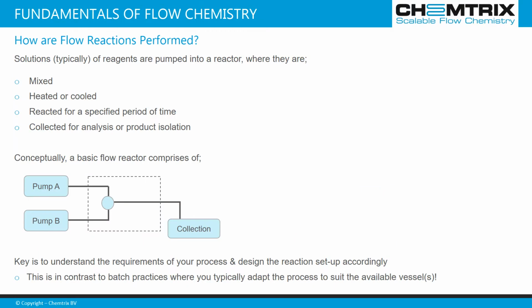For those of you that are new to continuous flow reactors, I'll just give you a brief overview of how we're using these devices, and this will hopefully give you an idea of how you can use them in R&D or your production environment. So I'm focusing on the use of static flow reactors, and this means that we work with solutions typically. And what you can see in the schematic is we have two solutions. We pump them from separate pumps, and we bring them to a mix point that's thermally regulated, and we collect the reaction mixture at the outlet.